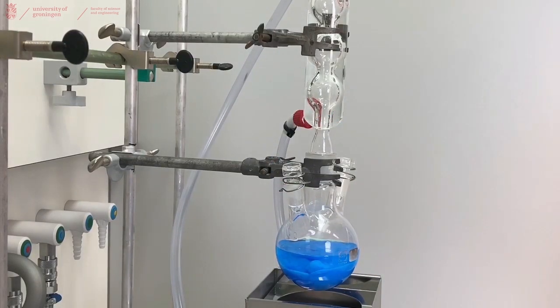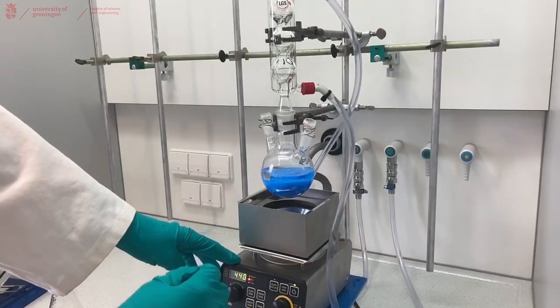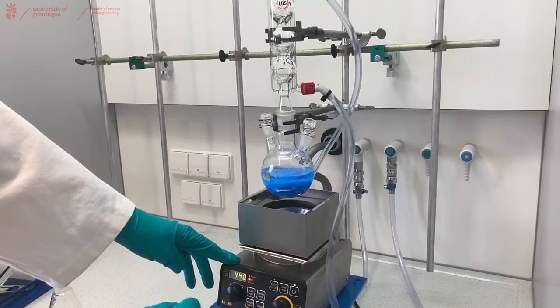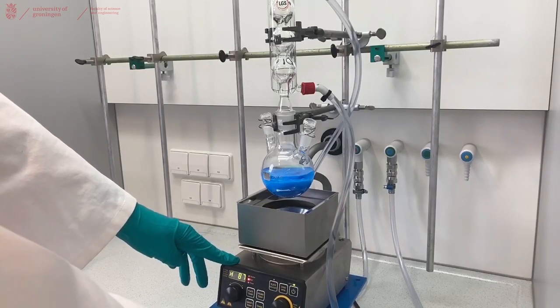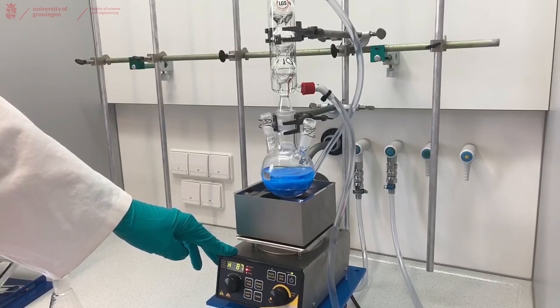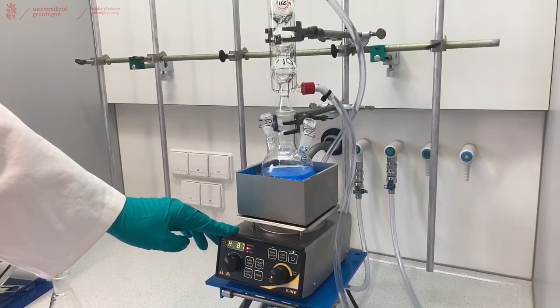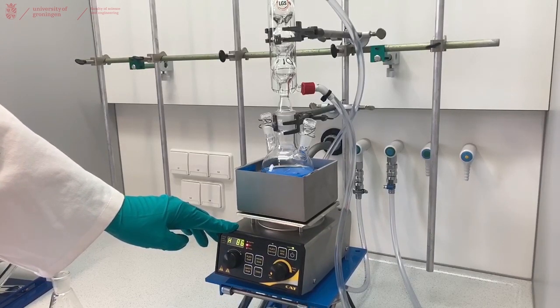Now we'll have to heat our solid and our liquid by turning on the IKA hotplate, setting it to a temperature higher than the boiling point of your solvent. So in this case with water, we put it above 100 degrees and rotate the lab jack up so it touches your flask.